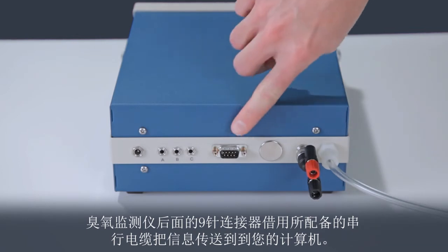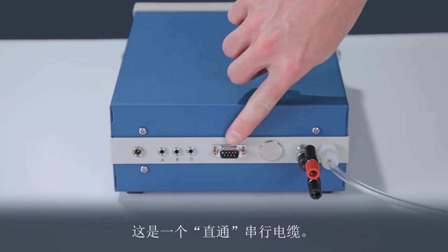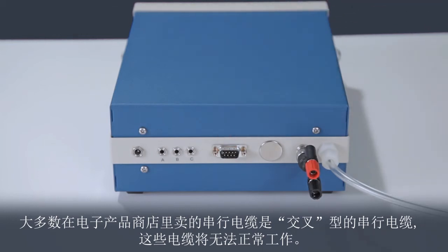The 9-pin connector at the back of the ozone monitor is used to provide communication to your computer using the serial cable provided. This is a straight-through serial cable. Most serial cables, such as those found in electronics stores, are crossover serial cables and will not work.